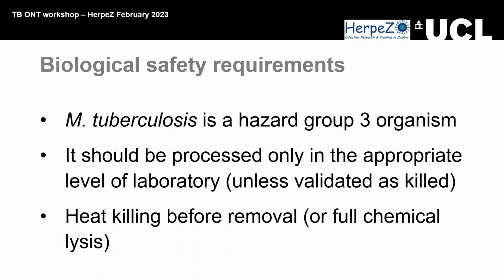With long read technology, you really want to have those long reads. So the way we do it is 80 degrees for 30 minutes, which should in theory kill the majority of the bacteria. But then we do all of our CTAB processing up to the isoamyl step in our cabinet, because until that point we don't believe that absolutely every bacterium will have died. I know the UK has very strict Cat 3 or BSL3 regulations compared to the rest of the world. So if you have validated it in your laboratory, that's fine.